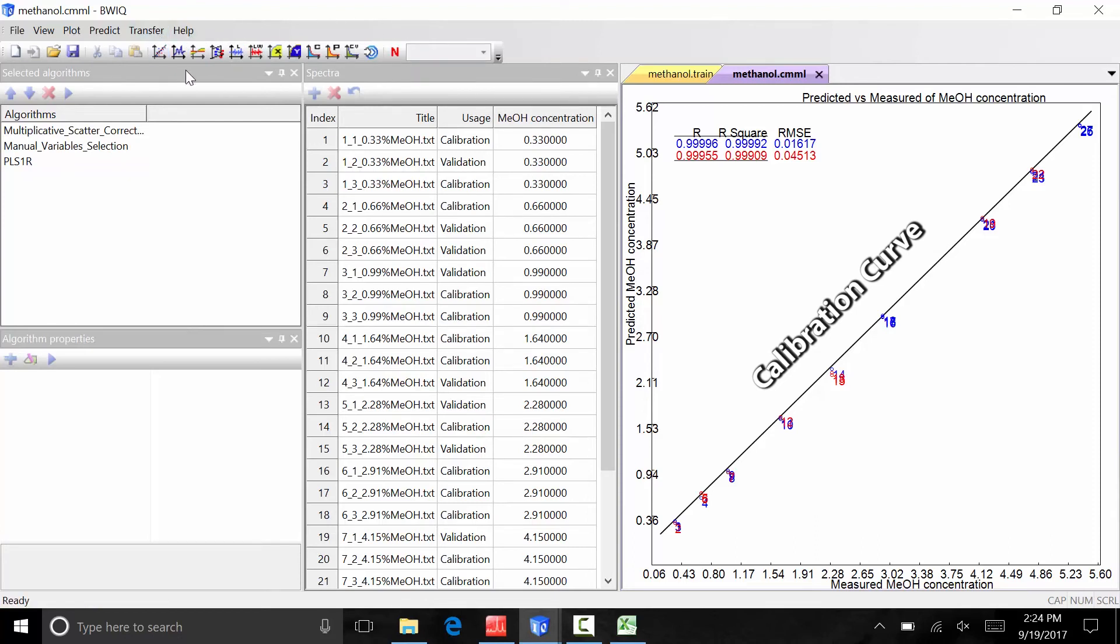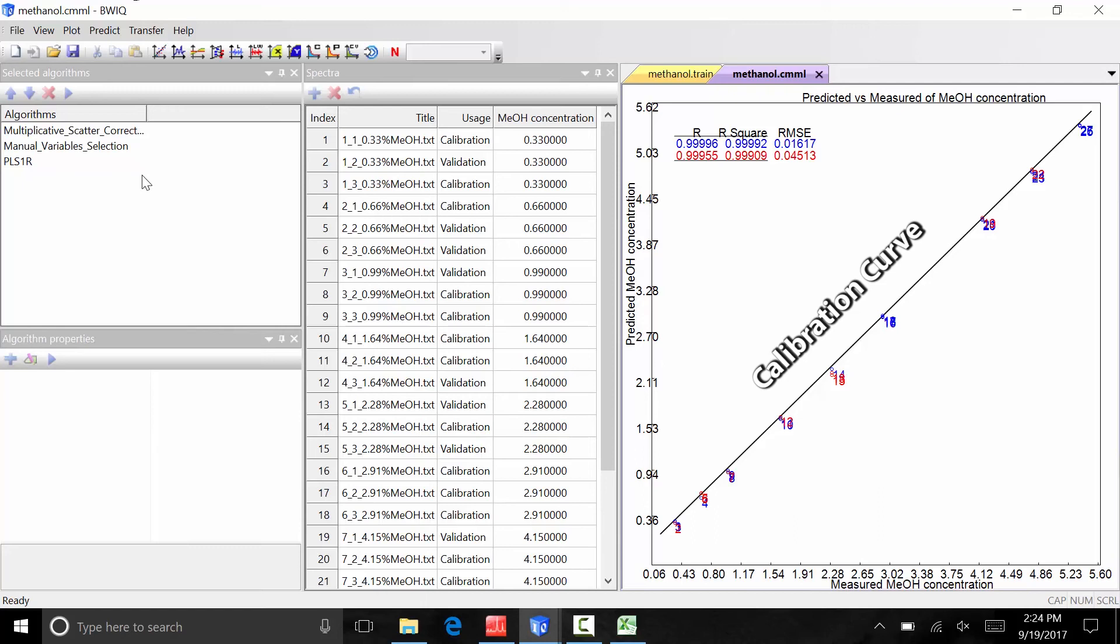Now that we have reviewed the model, we can use it to make quick, predictive measurements of suspected methanol-laced spirits. The BWIQ software can be connected to an iRaman series portable raman system for quick, online predictions. For an offline prediction in BWIQ, multiple spectra files can be loaded at once to do batch predictions.